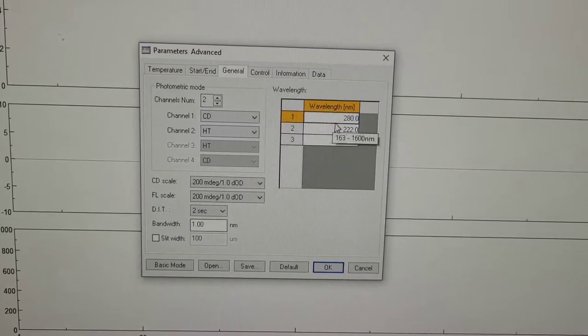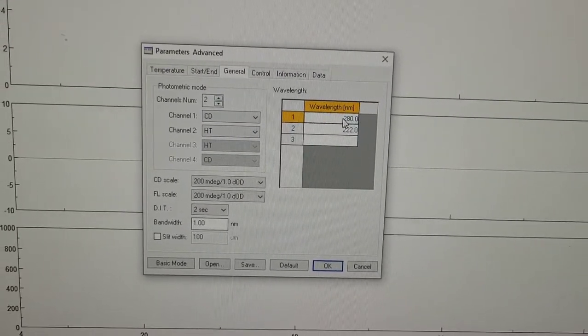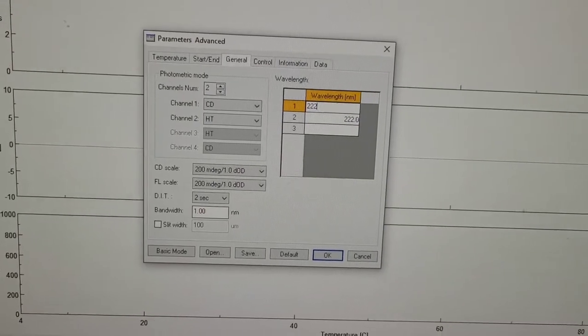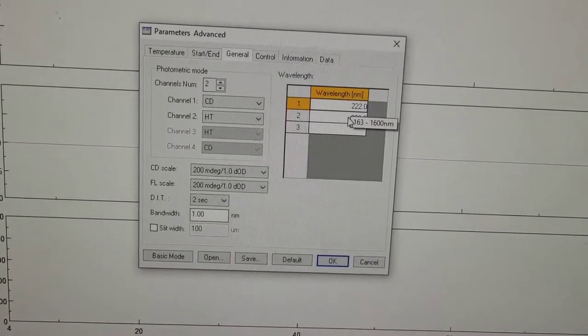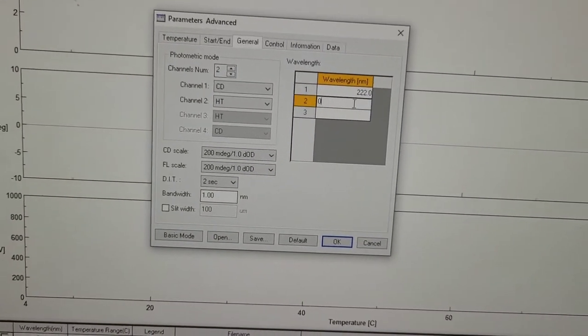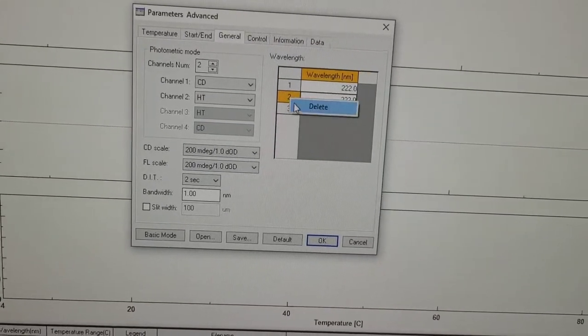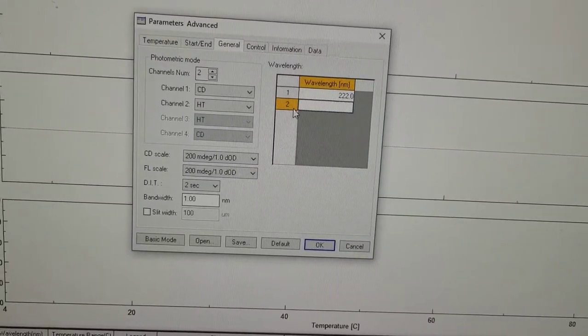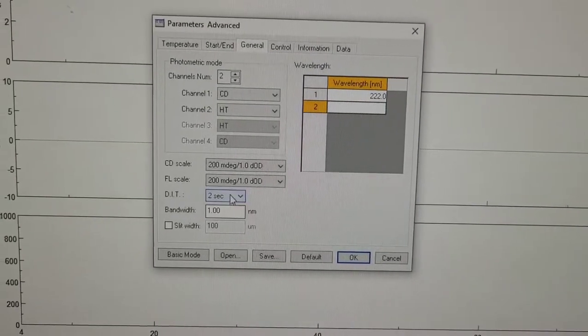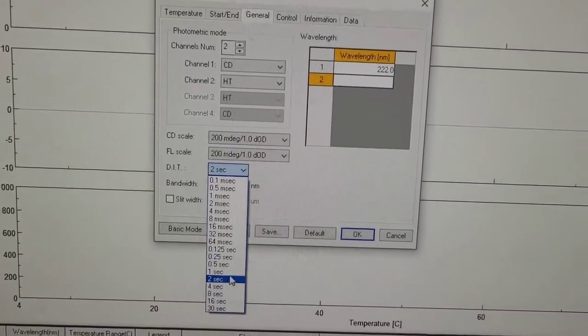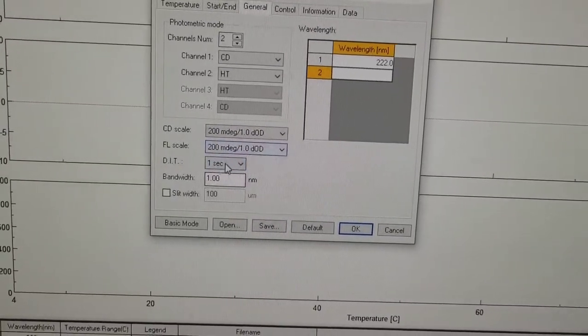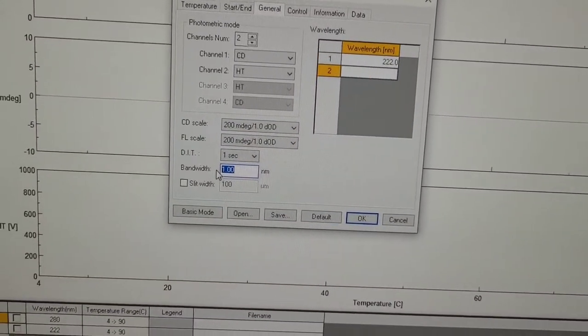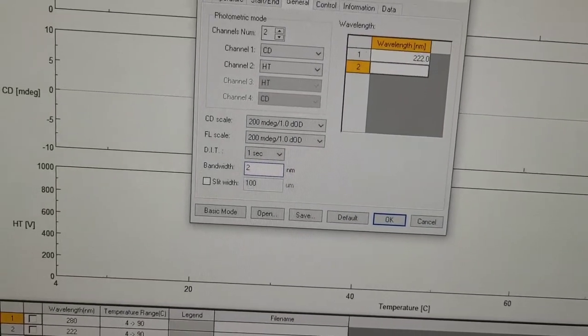And so for channel one, we have 222 nanometers. And for channel two, I don't want to measure anything and delete that. And I would like a DIT of one second.